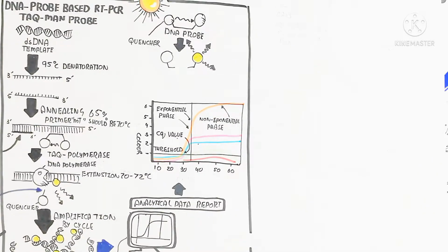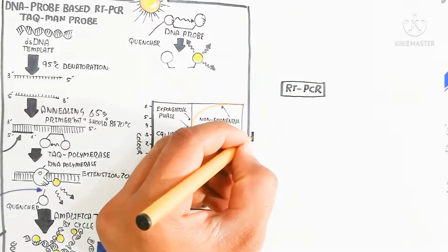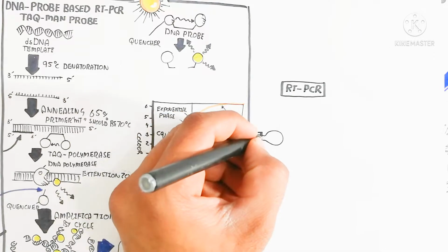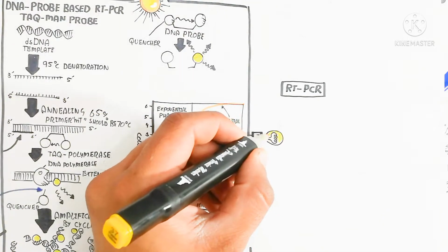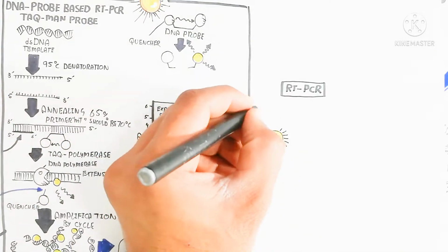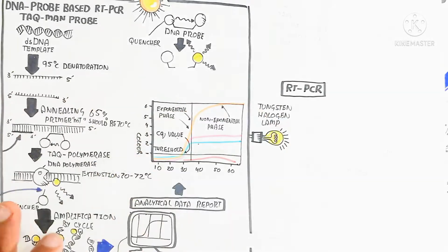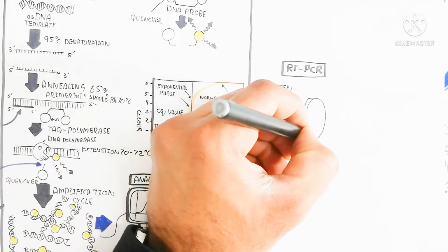Here is the real-time PCR function we will discuss after the amplification of the DNA in multiple vials. So we are preparing multiple vials for amplification of the genome. When more amplification of the genome occurs, more color will be produced. That is why, when more color is produced, it means the coronavirus infection is positive.